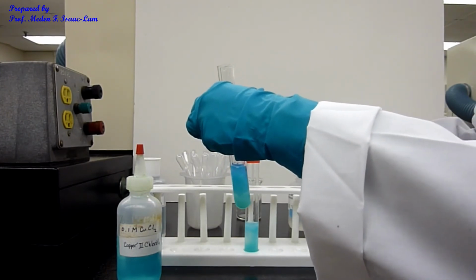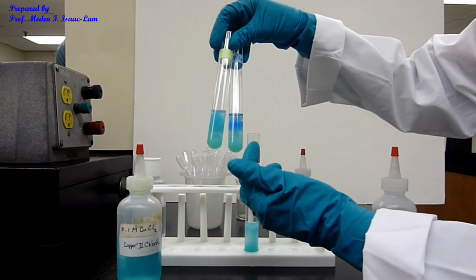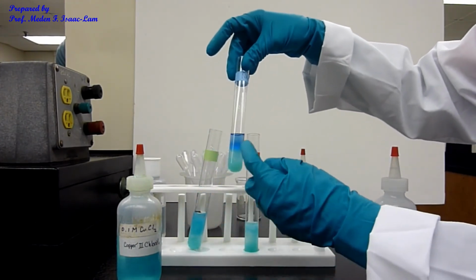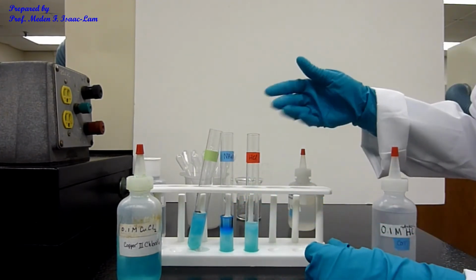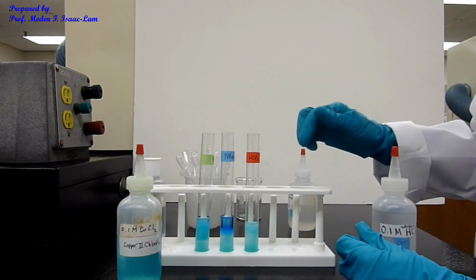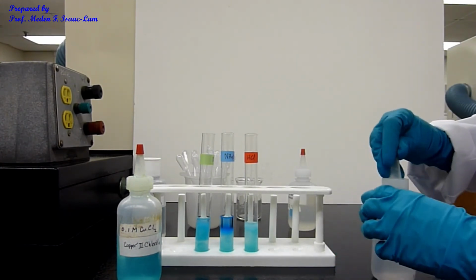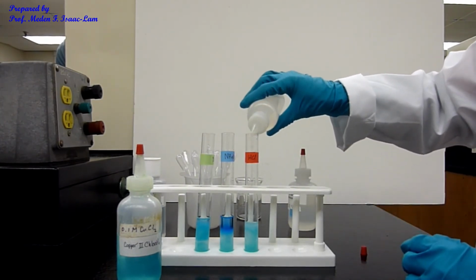So that's ammonium hydroxide. It has different effect, but actually produced also more precipitation. But the color actually became more blue, as opposed to an aquamarine-like blue color. And now we're gonna add hydrochloric acid in this tube, and almost the same amount.